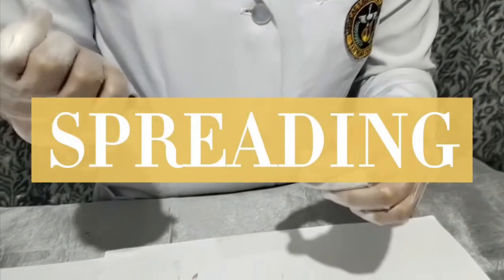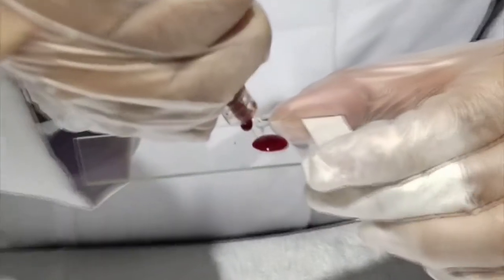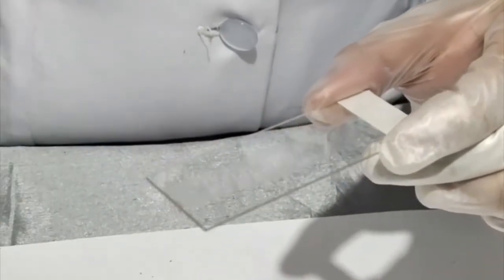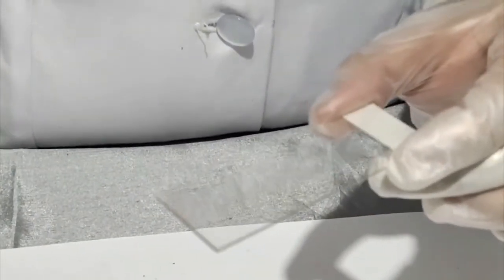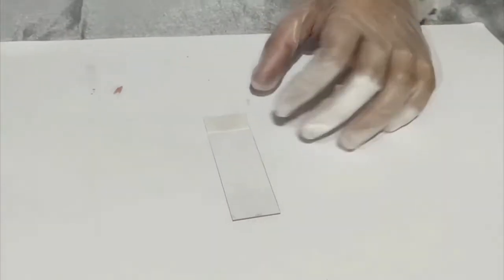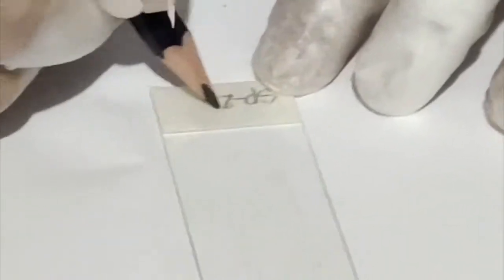The next method is spreading. Transfer a small amount of sediment on one end of the glass slide. And by using an applicator stick, spread the sediments throughout the slide, similar to how butter is spread on bread. And then, label your slide. And there you have it.